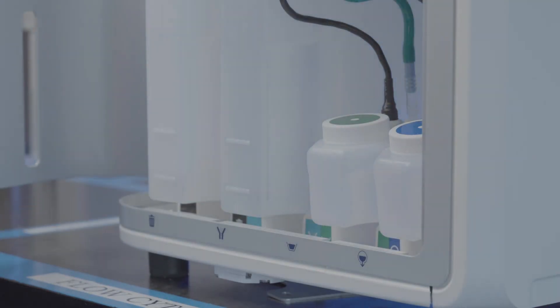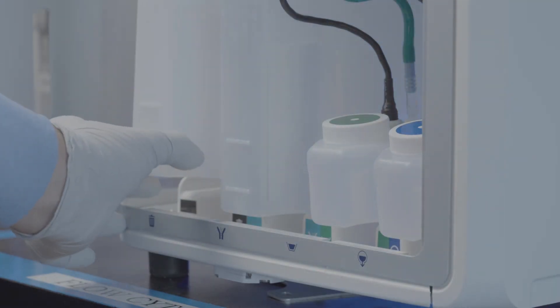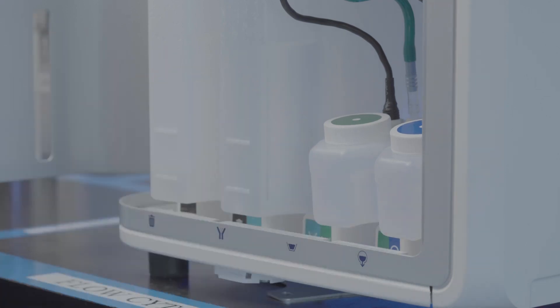First, make a visual inspection. Check that the waste is empty and other bottles have fluid in them. Then check that detectors are in the correct place.